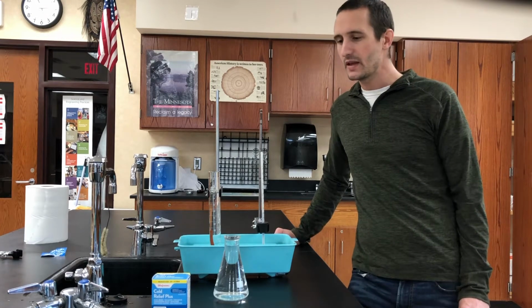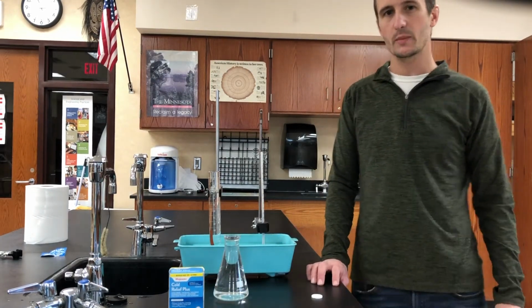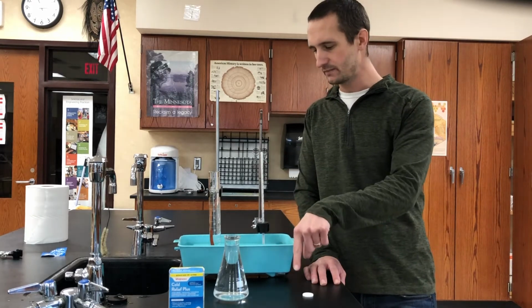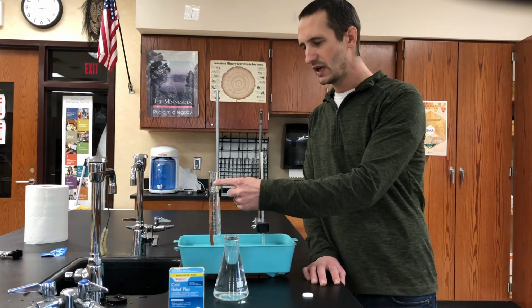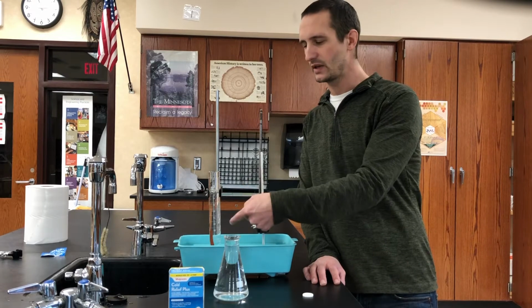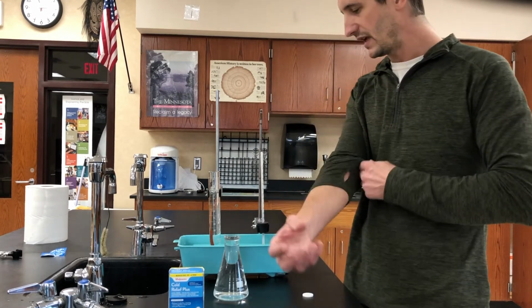And so in this little setup that I have here, we're going to actually be using some Alka-Seltzer to generate carbon dioxide gas. And I'm going to drop the Alka-Seltzer tablet in my flask that's filled with water, and we're actually going to bubble that gas through a tube. And I have a graduated cylinder here that I've filled with water and then inverted. So any gas that's collected is going to be displacing the water out of that graduated cylinder, and then we can measure and figure out the volume of the gas produced.